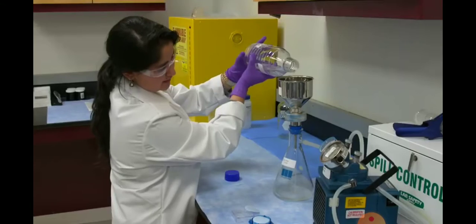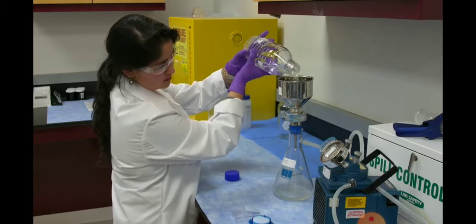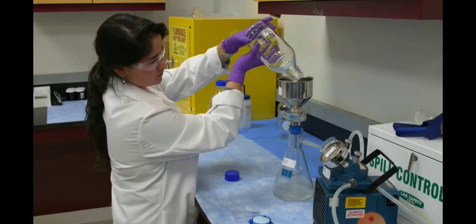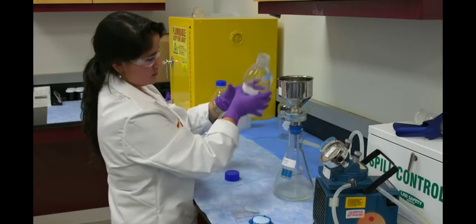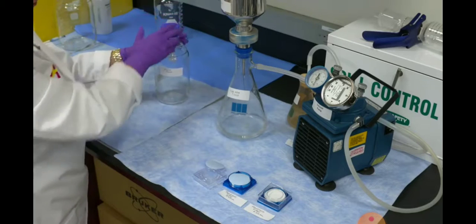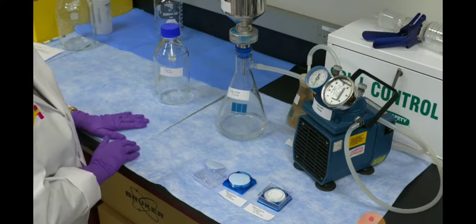It is being filtered in the sidearm flask. Now you wait for the filtration process to be completed.